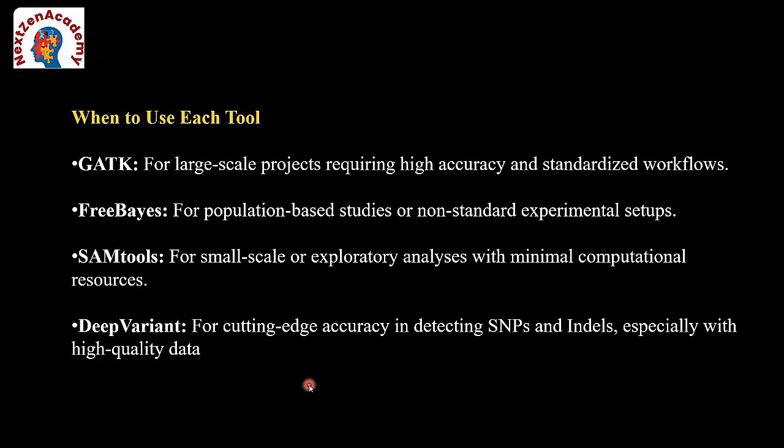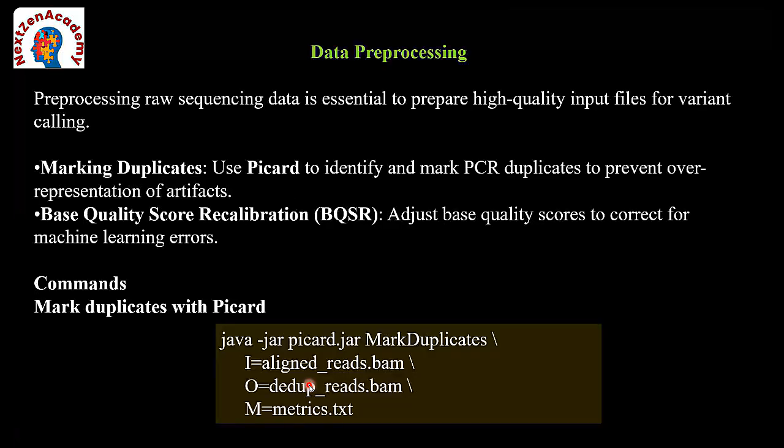The main aim is to utilize the deep learning process to interpret sequencing data. It supports whole genome, whole exome, and targeted sequencing datasets from any platform.